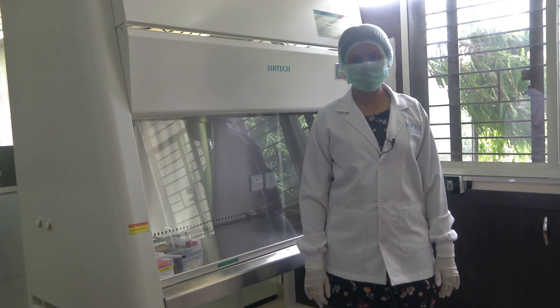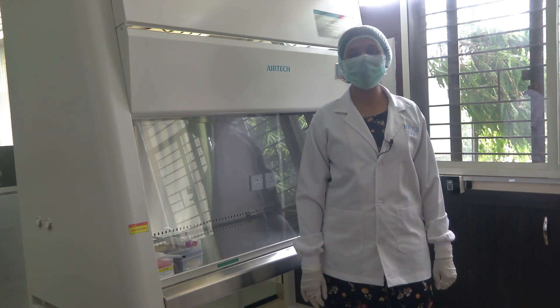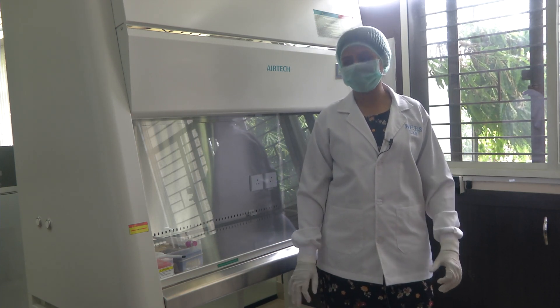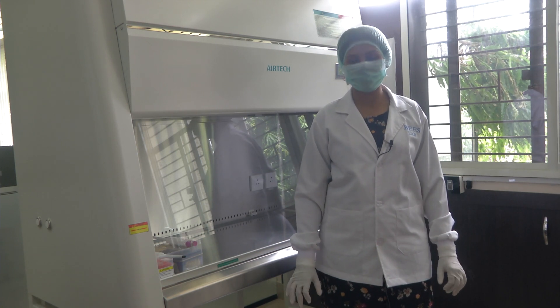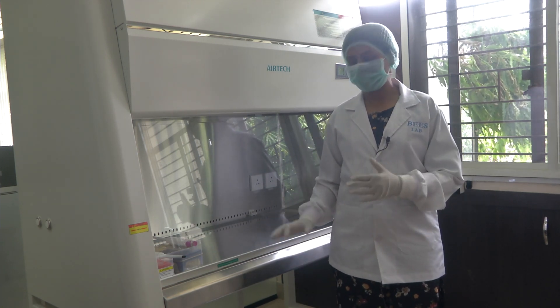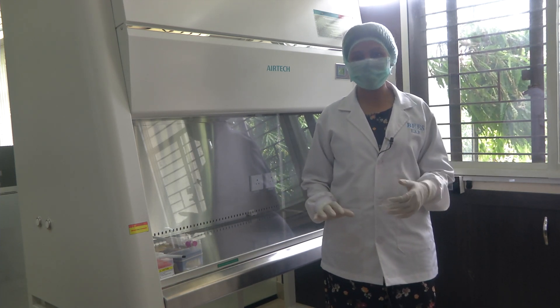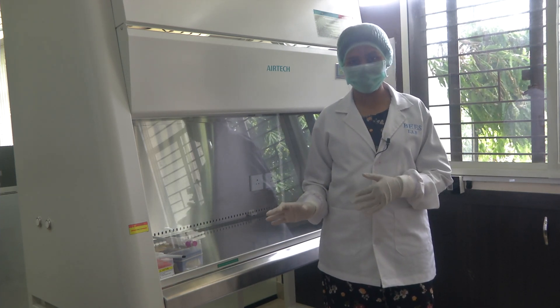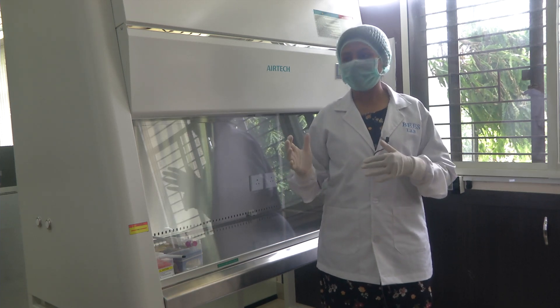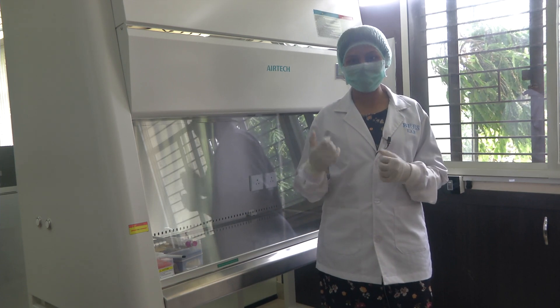Hello everyone, welcome to the course on sensors and actuators. Today in this module we will be discussing more about an equipment called the biosafety hood. There are different cabinets depending on the containment. Let us get into the details about what is a biosafety cabinet and what are the different cabinets which could possibly be there in a biological study workspace.